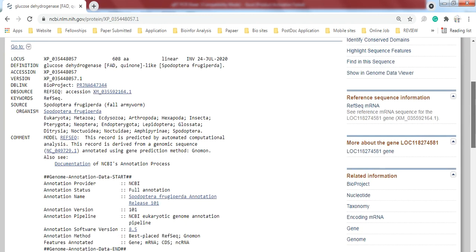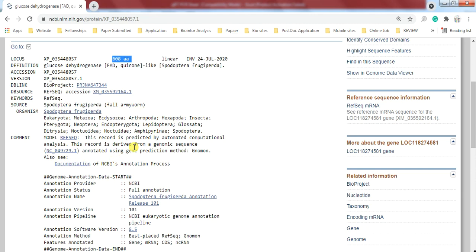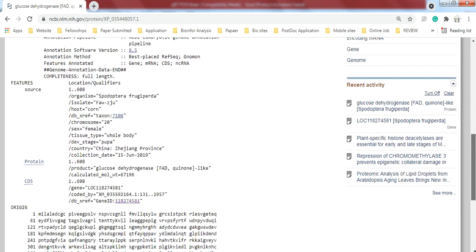So it gives the information about this gene - from which organism it is. Here is some other information like amino acids and some other details you can check according to your requirement.